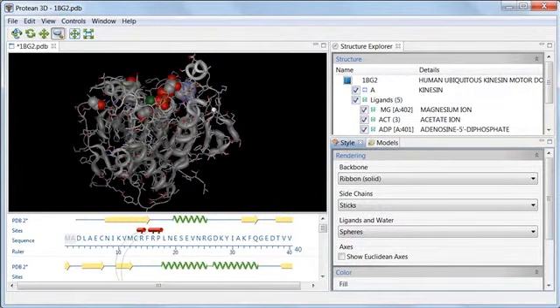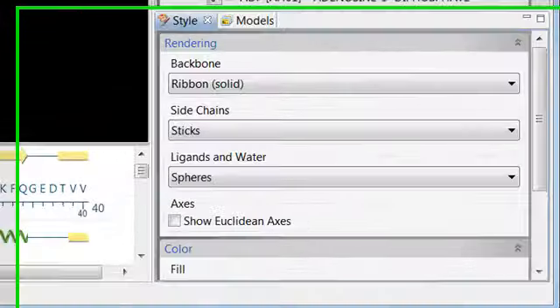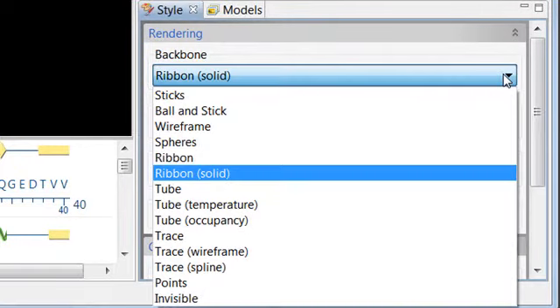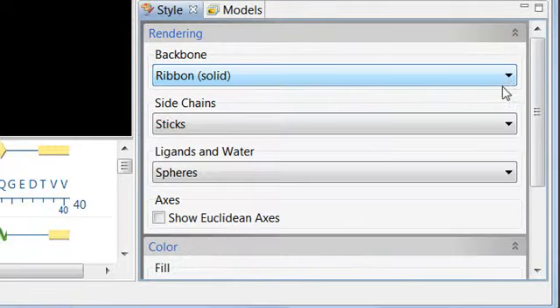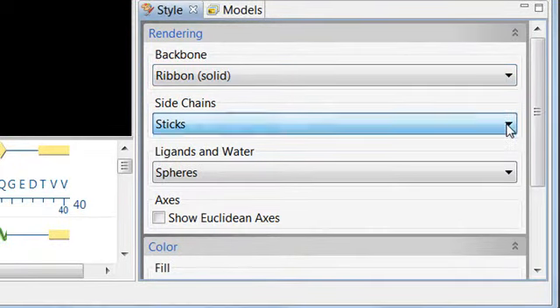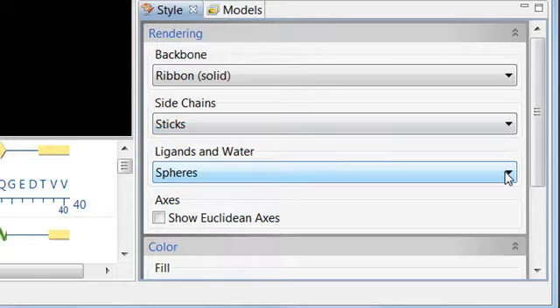The rendering bar has three drop-down menus, one for the backbone, one for the side chains, and another for the ligands and water.